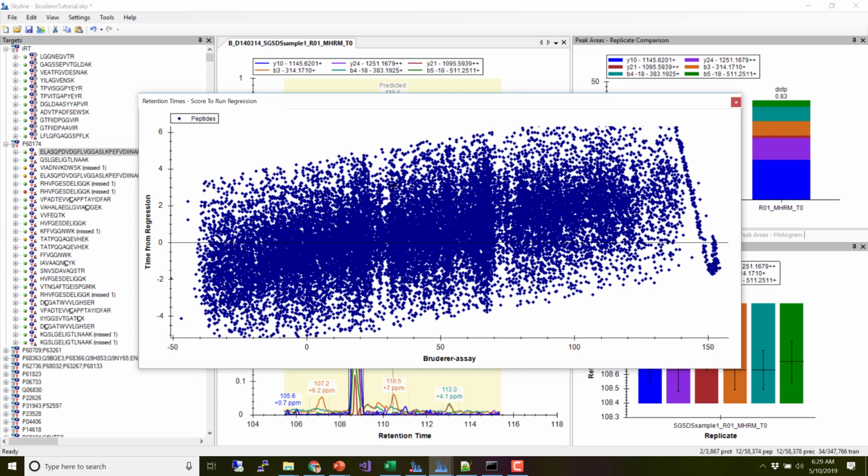And there we go. Wow, that's really strange. There's something going on here which I don't totally understand yet. This is the first time I've ever looked at this. It's actually going outside the 10-minute window, which I don't quite understand.